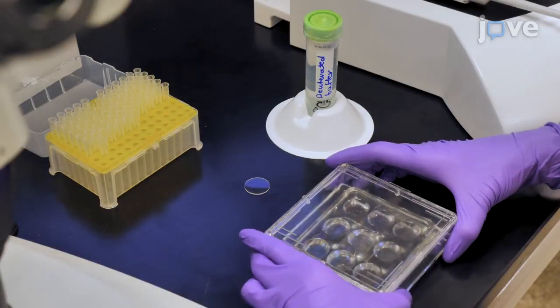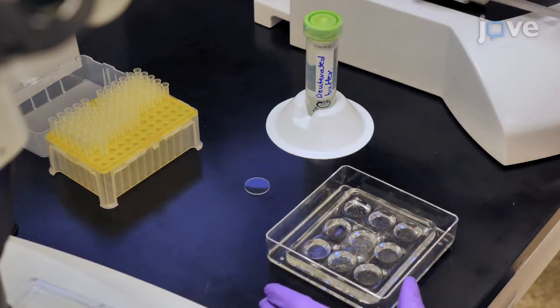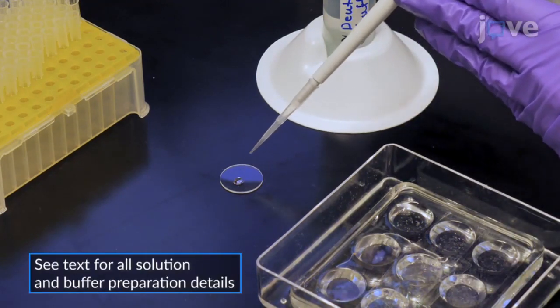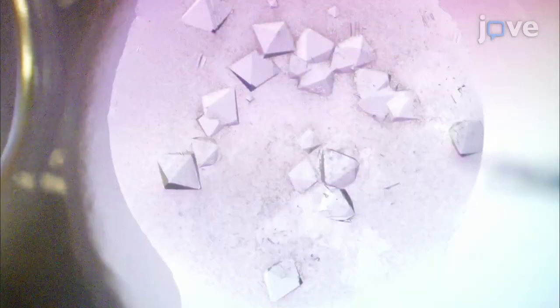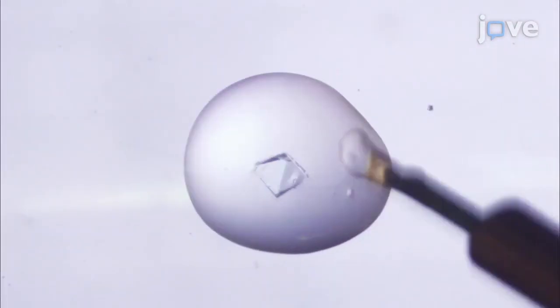For crystal harvesting, open the sealed sandwich box containing the protein crystals in a 9-well large volume siliconized glass plate, and use a micropipette to transfer 10 to 20 microliters from the crystallization reservoir solution onto a glass slide. Evaluate the crystals with a microscope. Use an appropriately sized microloop to harvest a crystal, and place the crystal in the drop of reservoir solution.